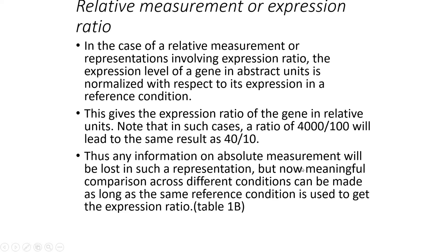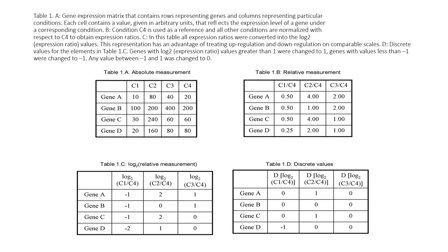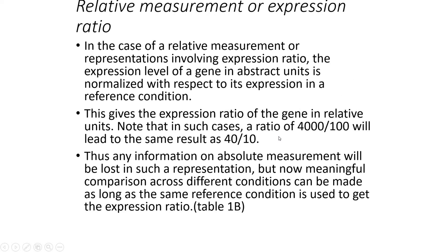Thus, because we are normalizing all the conditions by the C4, because the reference condition is the same for all other calculations. So it is shown in table 1b, you can see here. This is the relative measurement after the normalization.